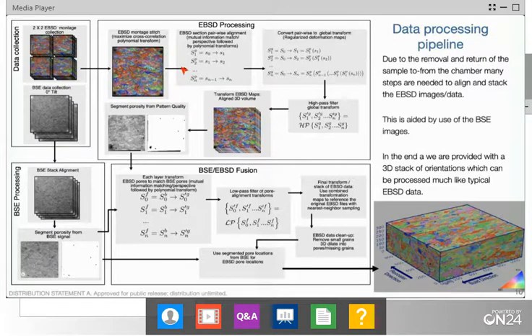So that's basically we matched section 0 to section 1. And then we are matching section 1, but not the new version of 1. It's still the old version of 1 to 2, old version of 2 to 3, et cetera, et cetera. That gives us how we need to move from each step to each step. We then can take that, we regularize that into certain displacement maps. So those displacement maps tell us exactly how each pixel needs to move.